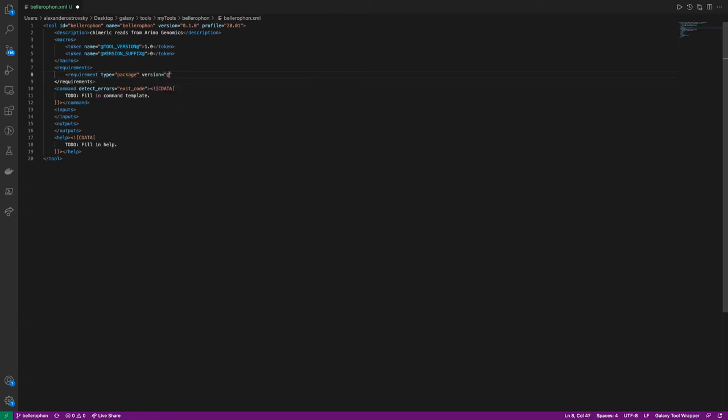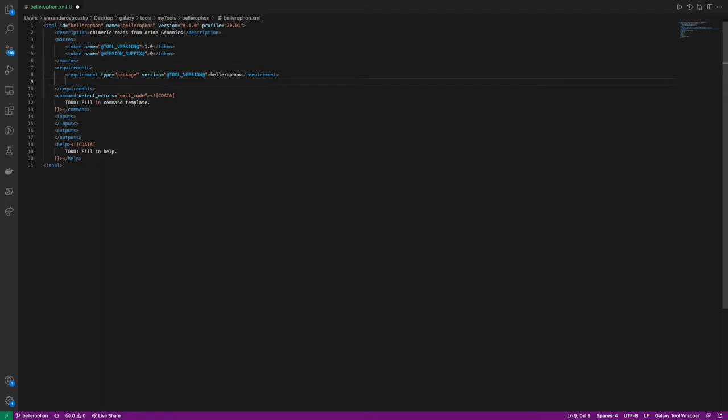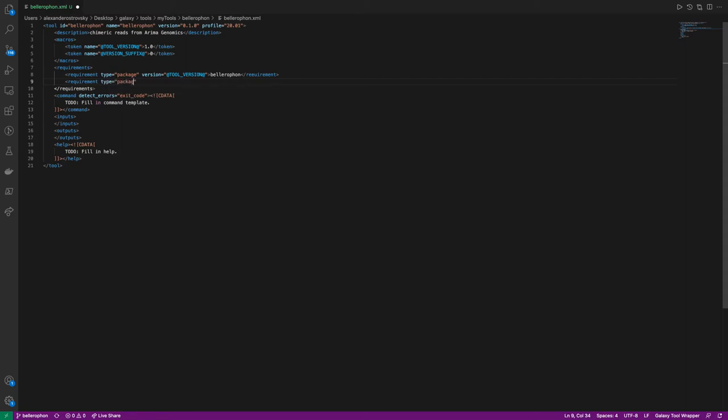This is version 1.0. However, we will be using the token tool version that we wrote before in the macro section to specify the versions. This means that we only have to iterate the tool version in one place, as the tool itself increases in version. The other package that we will be using is SamTools. The most recent version of SamTools at the time of recording is 1.12, and we will therefore set that as the version string.